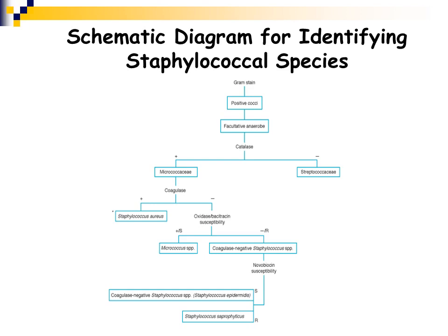If it were a urinary tract infection and you wanted to see if it was a Staphylococcus saprophyticus over any other coagulase negative staph, you would then do your Novobiocin susceptibility test. If it's resistant, meaning the organism grows right up against the Novobiocin disc, it's indicative of Staphylococcus saprophyticus.